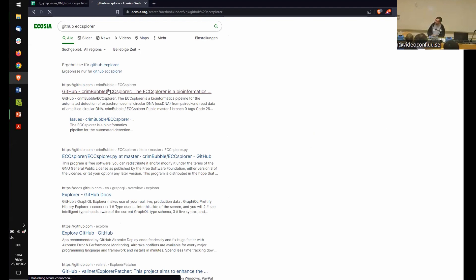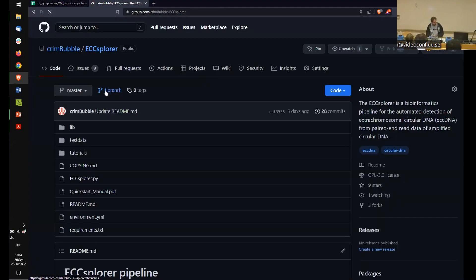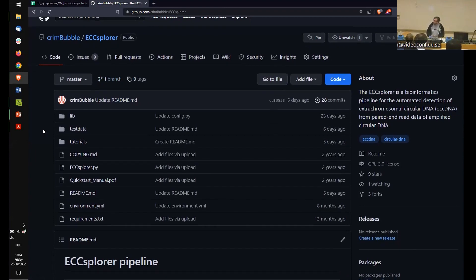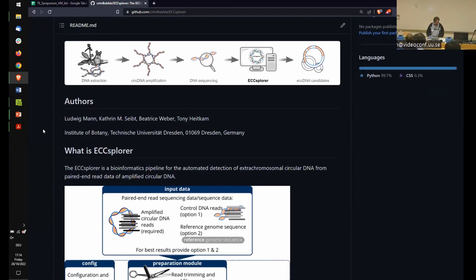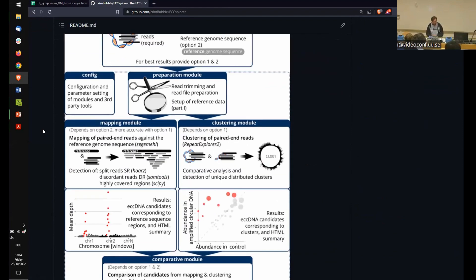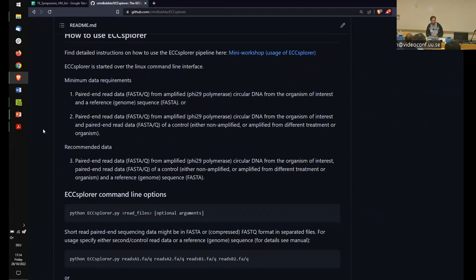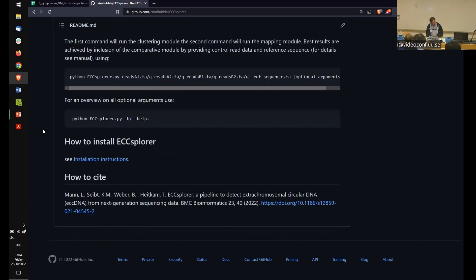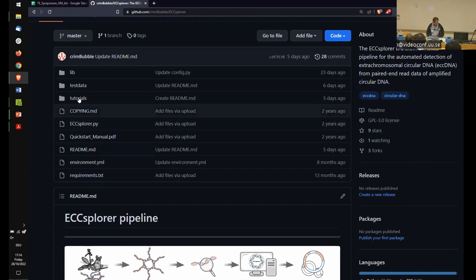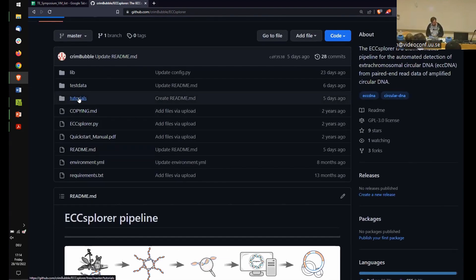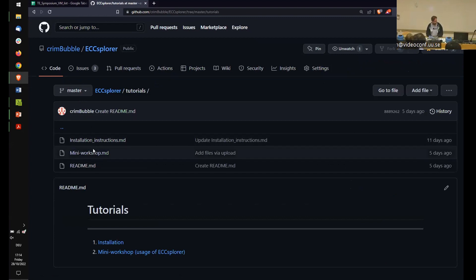You'll arrive at the GitHub repository, which may appear in dark mode or light mode depending on your setup. There's a brief description of the pipeline itself and a citation if you use it. There are also explanations and examples of how we've used it. For today, we'll navigate to the tutorials section and to the mini workshop.